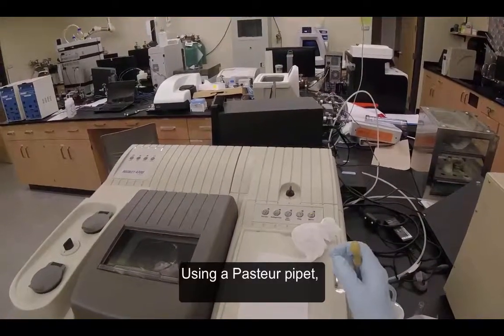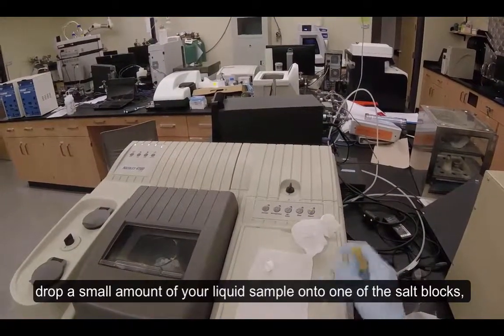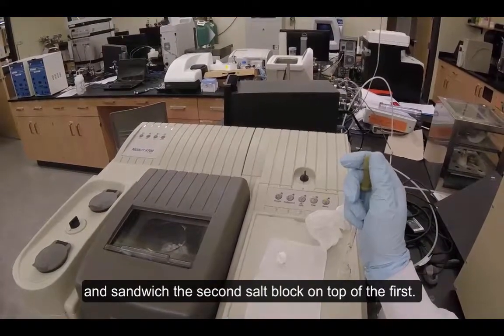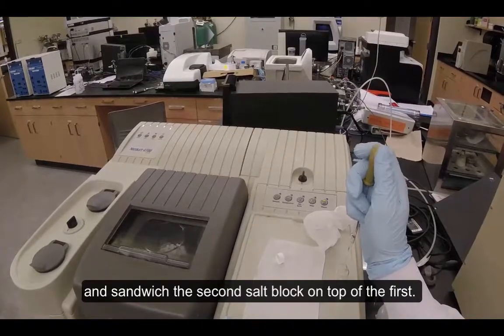Using a pasteur pipette, drop a small amount of your liquid sample onto one of the salt blocks and sandwich the second salt block on top of the first.